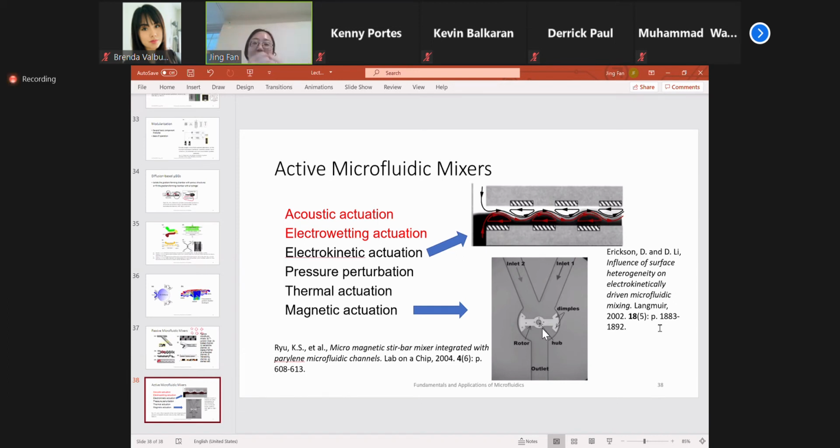If they merge together, then the mixing of the fluids from these 2 droplets, after they merge into a larger droplet, can be very fast because of the small size of the drops. So this electrowetting actuation actually just provides a solution for the droplet mixing.